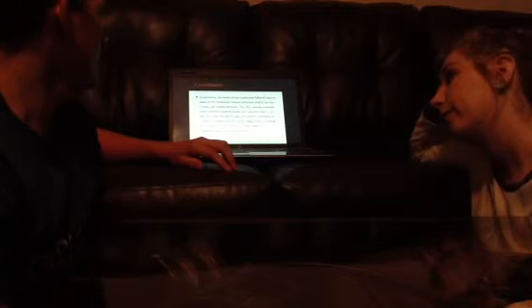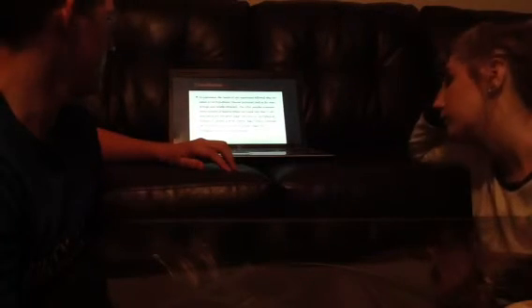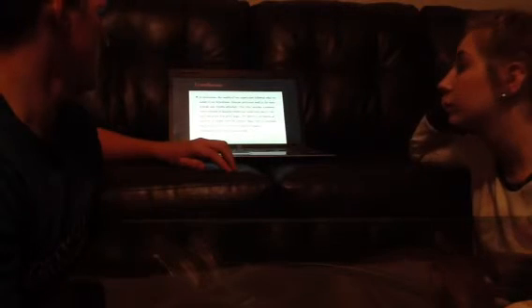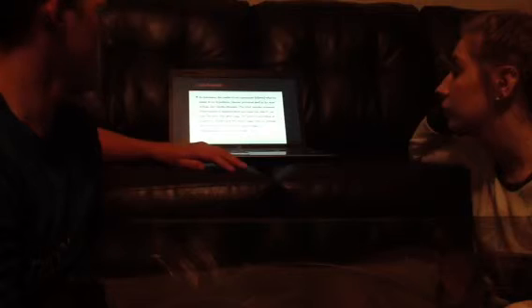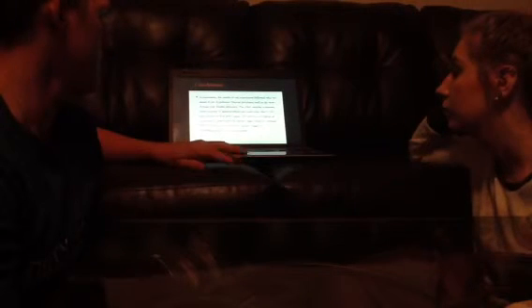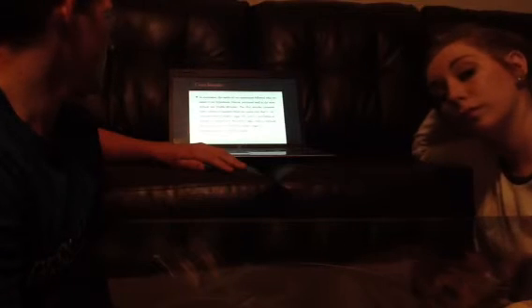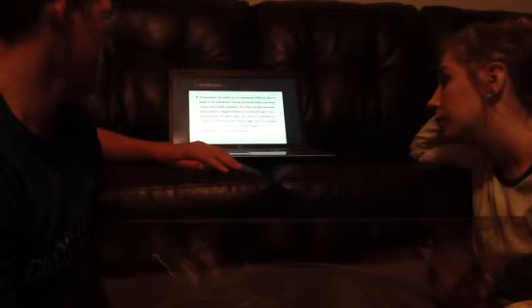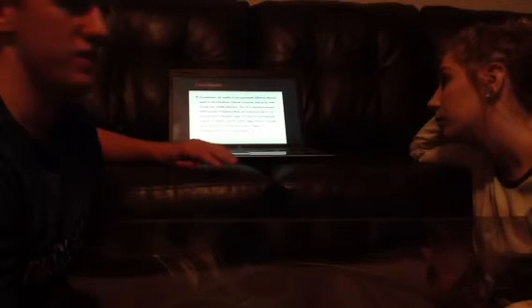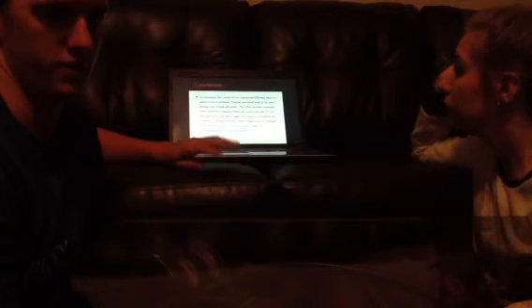Conclusion. So, in our conclusion, the results of our experiment follow what we stated in our hypothesis. Glucose portrayed itself as the most popular and reliable attractant. The other samples contained fewer colonies of bacteria, from which one could infer that E. coli wouldn't prefer the given solution. The positive correlation of number of colonies with the simpler sugar helped us conclude that the bacterium preferred the less complex sugars or monosaccharides over the more complex sugars or disaccharides.